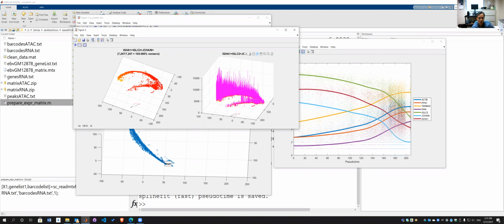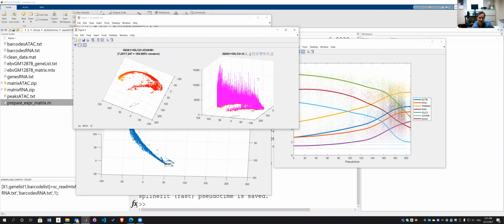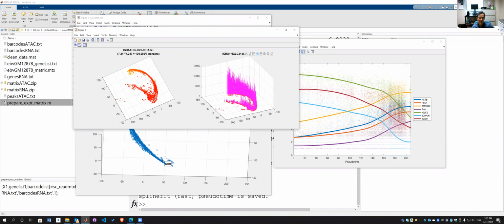Okay, so it's clear to me this trajectory, this long arm created by the branch, was driven by some of these key genes, making them least similar to cells in this bottom, the base of here, the group.